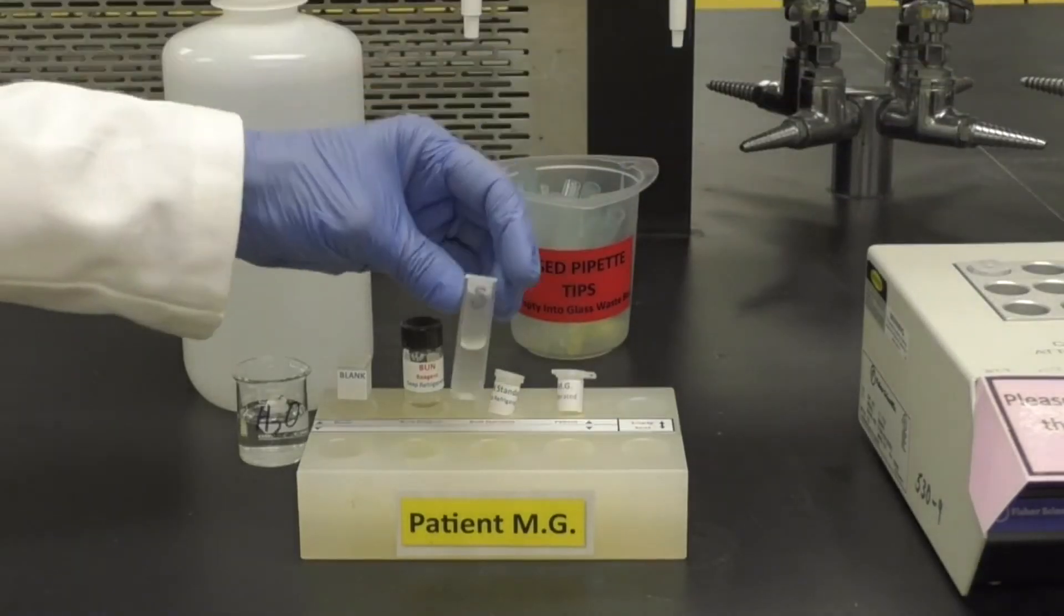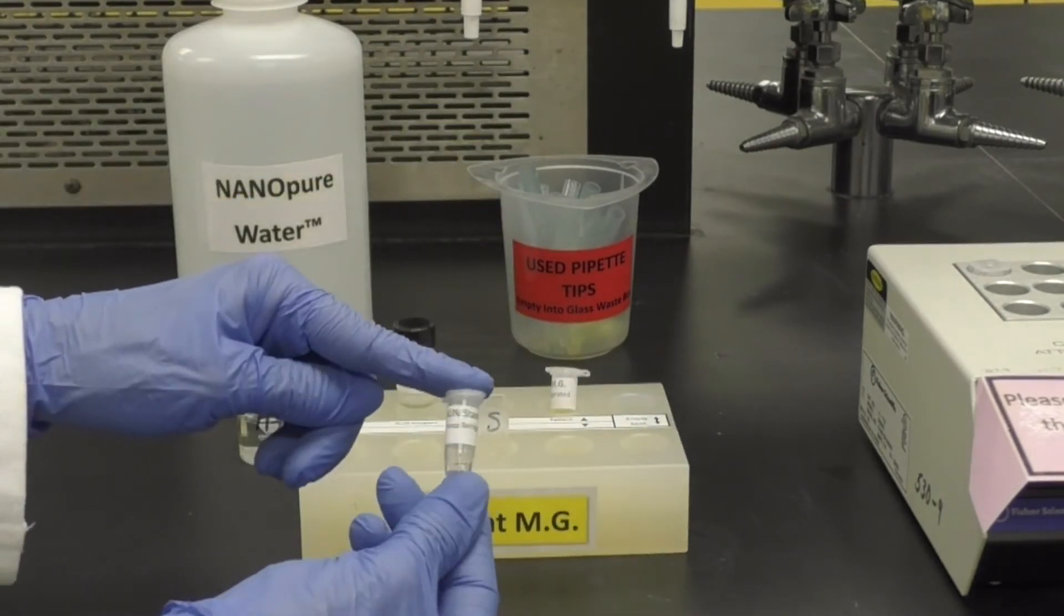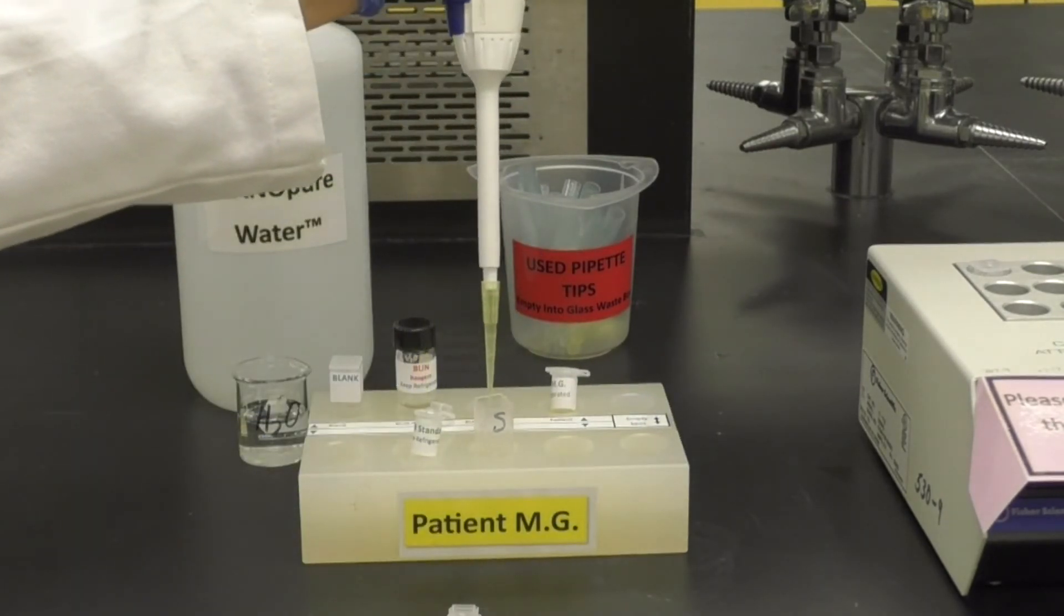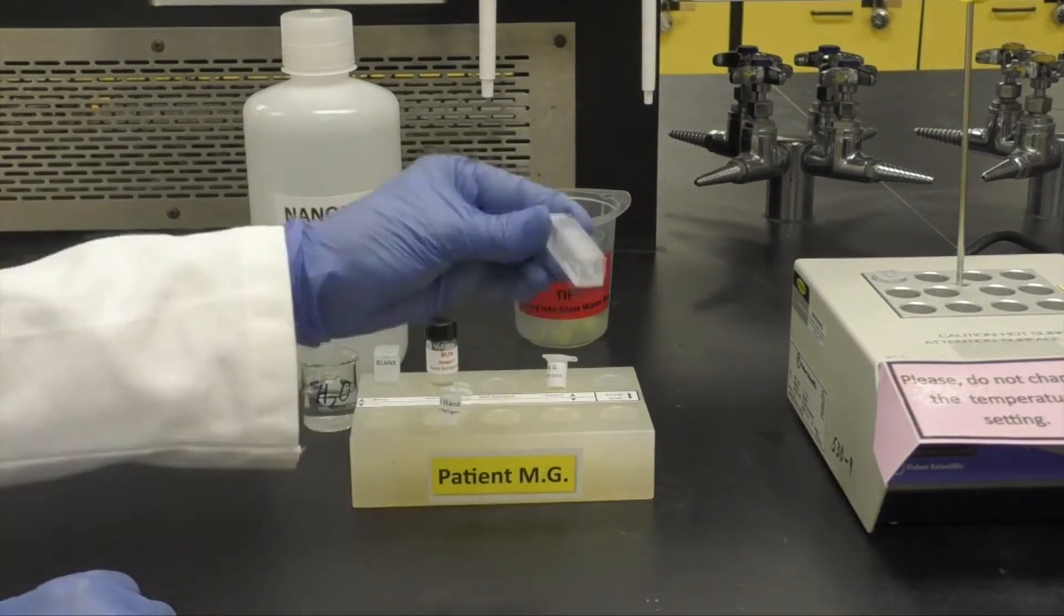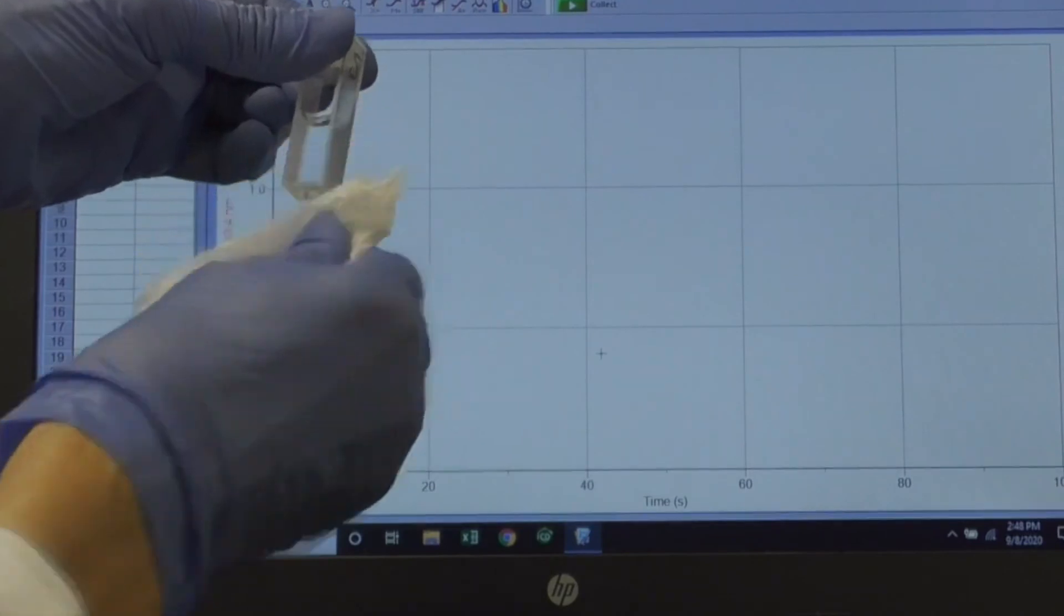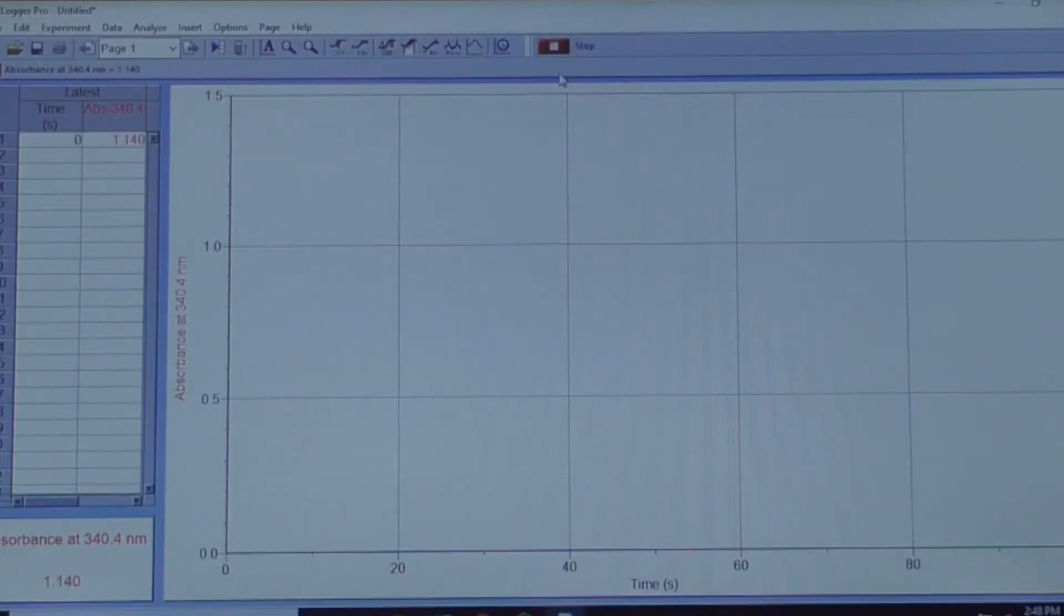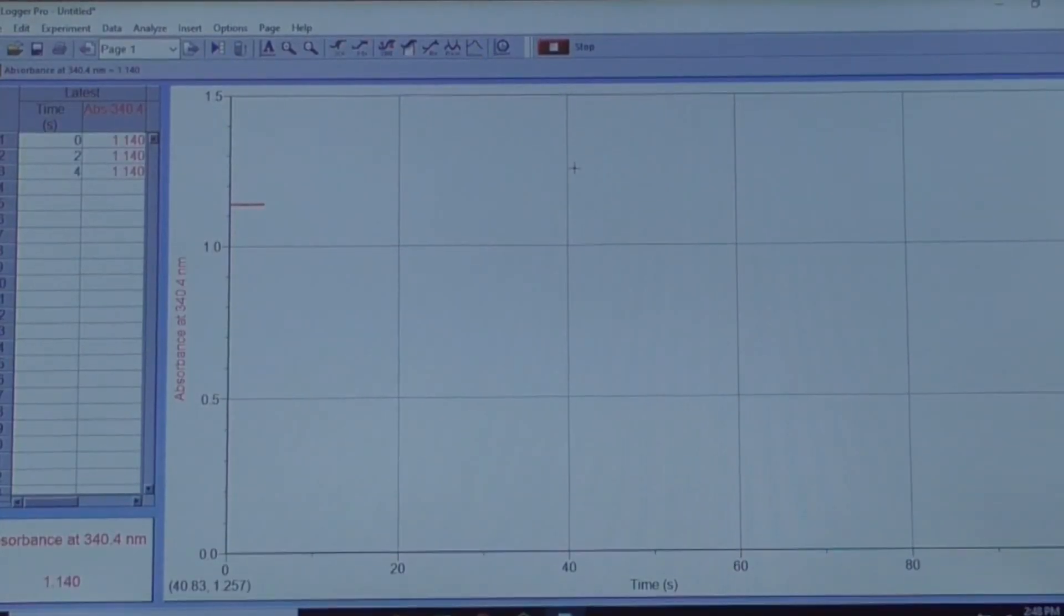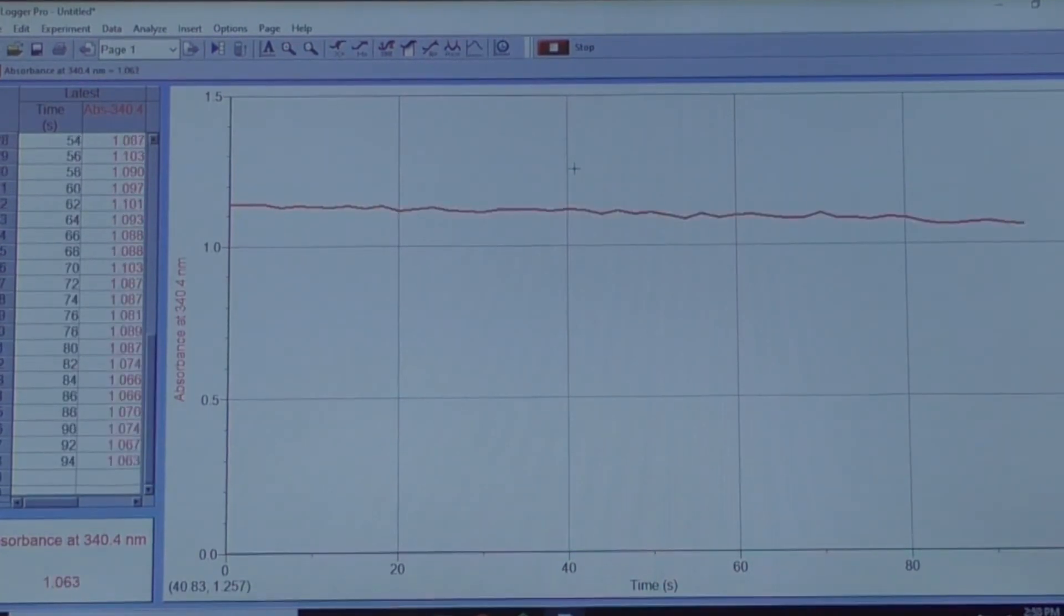When 5 minutes is up, remove the cap and add 20 microliters of the BUN standard, rock to mix, and quickly wipe the cuvette, place it in the spectrometer with a clear side facing forward, and click Collect. Do not click Stop. The run will end automatically when the 100 seconds has elapsed. Based on the settings, you will see data appear every 2 seconds.